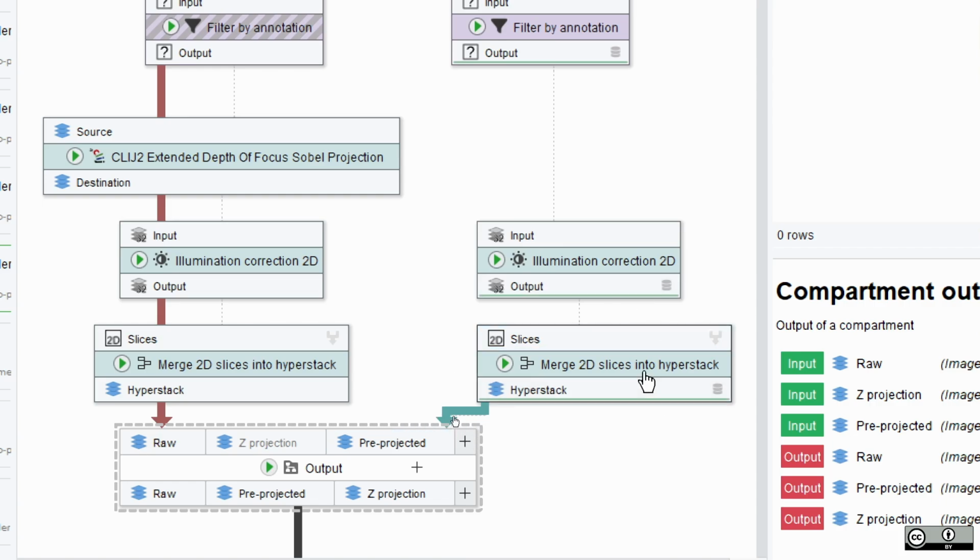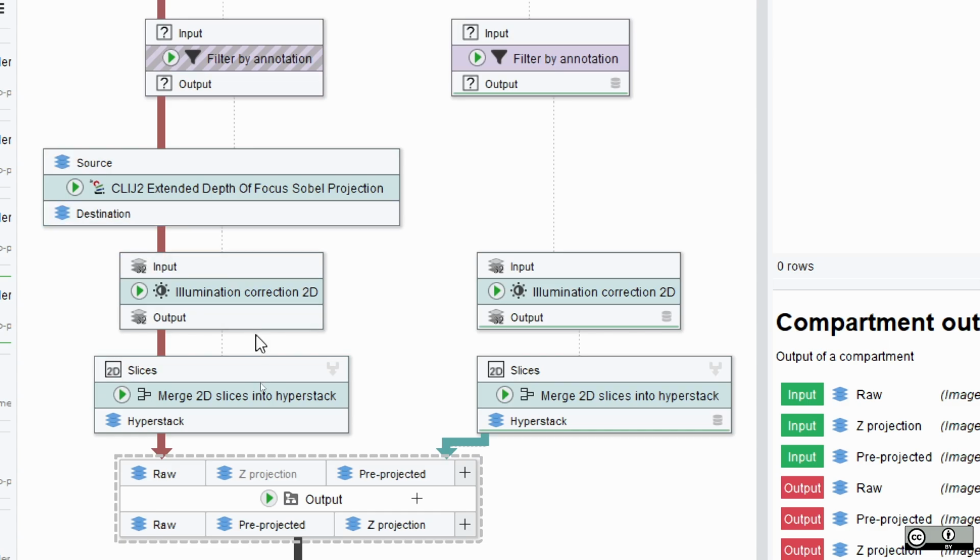Okay, so we have our output. Now, one more thing I wanted to note to you is that when I was setting this up for you last night, I realized this is going to take too long, but I didn't want to delete this input to my output node. But I also didn't want to have to go through this. I can go through this and explain it to you, but at this point, it doesn't matter.